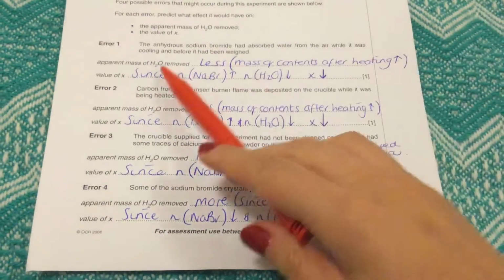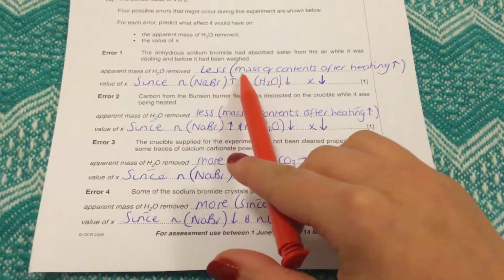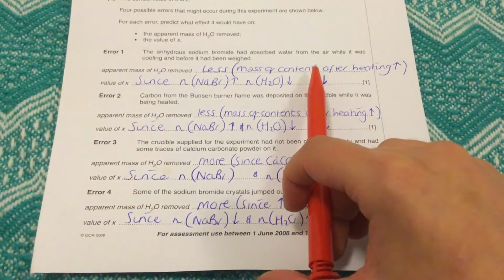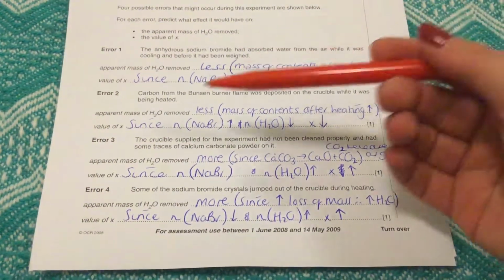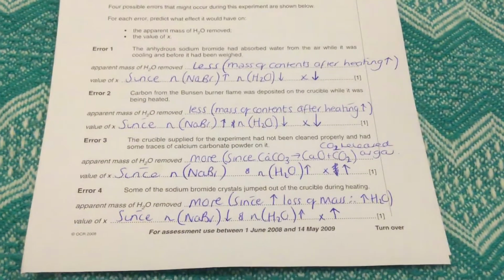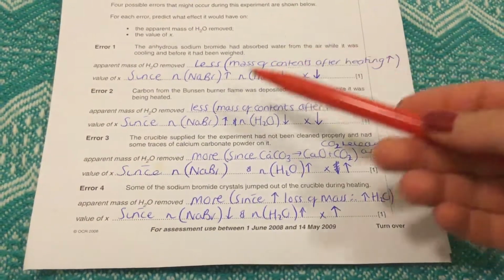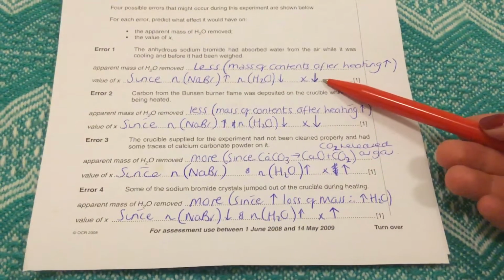So the apparent mass of water that's removed is going to be less, because when you put the crucible back onto the balance, the mass of the contents after heating is going to appear to be greater. Therefore, the difference between that and the mass prior to heating will actually be less. So if we think about this in terms of the number of moles, the sodium bromide will appear to be greater, because our mass is going to appear to be greater, and the number of moles of water will appear to be less. Then x will actually reduce.